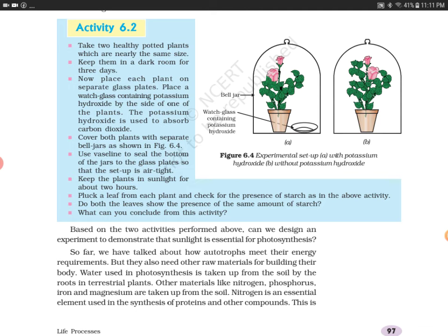Place each plant on a separate glass plate. Place a glass containing potassium hydroxide by the side of one of the plants. Potassium hydroxide is used to absorb carbon dioxide — it reacts with CO₂ to form potassium carbonate. This removes carbon dioxide from inside one of the jars.